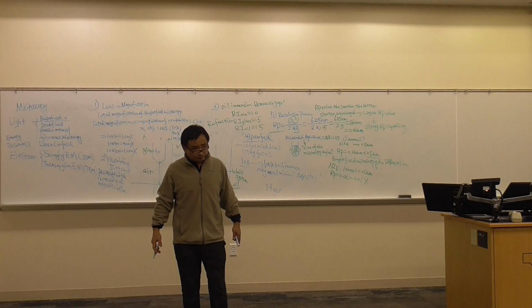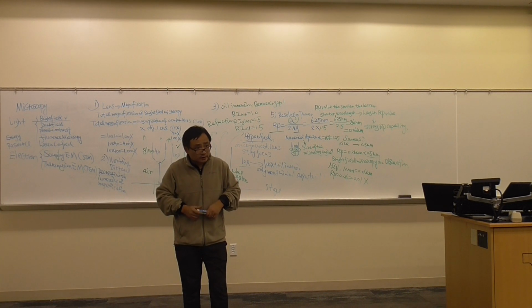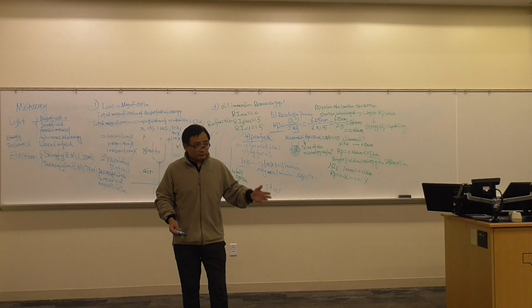What we want to see is the morphology and the arrangement, because we could get a brief idea what it looks like, and it could give a preliminary diagnosis. So we will talk about that later on. If we do a staining technology, we get a sputum sample from a patient who keeps coughing and had a fever.